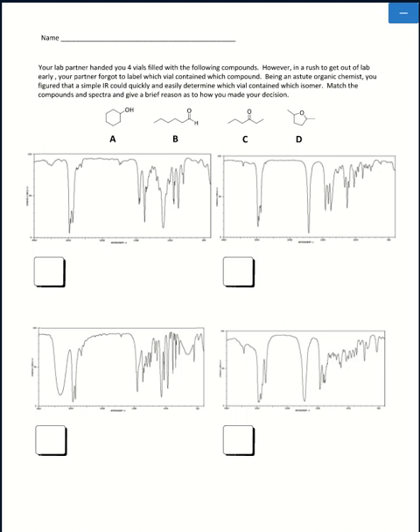First one, IR spectroscopy. It's very useful for determining the presence of certain functional groups or certain types of bonds in your molecule. For example, a carboxylic acid functional group, a carbonyl C double bond O, C single bond O, or C bonded to a chlorine atom, that's what IR will tell you. It will not be able to tell you the identity of a molecule if you don't already know it, but it can be used to determine what kind of bonds and functional groups are in your molecule. So for this first page, there are 4 molecules to look at.